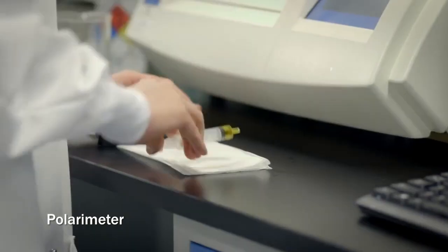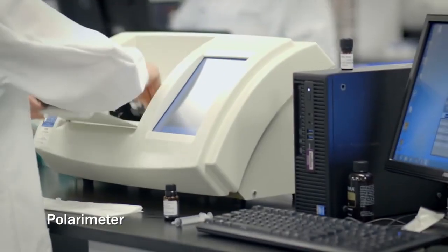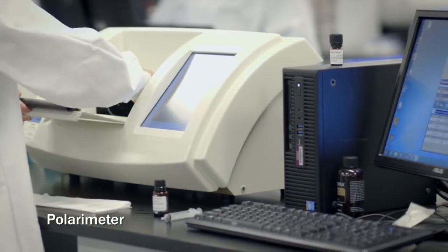Optical rotation, in which we use a polarimeter, tests the chirality of the molecule. Sometimes chiral molecules can be missed on GCMS, so it's another verification.